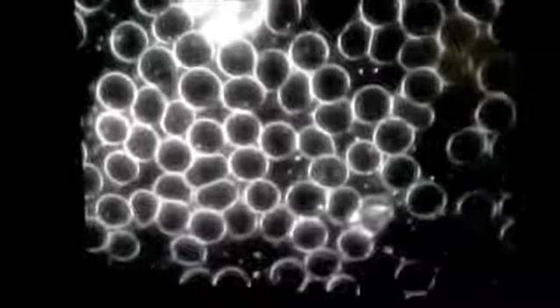The white blood cell actually moves around throughout the blood, seeking bacteria, red blood cells that are malformed, which are your free radicals, and they either digest it for more energy to move about the blood, or use it for more energy to move around and clean up the bacteria and whatever is going on, parasites, that type of thing that's going on in the blood.